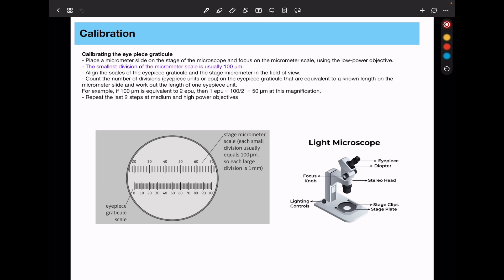So to calibrate, we're going to place the microscope slide on the stage. You can see this is going to be the stage here and this is going to be the eyepiece. We're going to use the focusing knob to focus. We do this first under low power in order to locate the structures we're looking for. And again in this case, our aim is to make sure we can match up the eyepiece graticule as well as the stage micrometer to find out how many subdivisions of one equal the other.